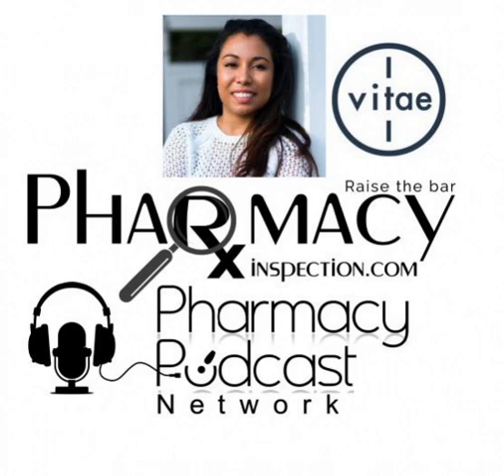But then once we are confident with our internal testing data, we then do send out samples to external testing labs. And external testing labs for, let's say, water-based formulations have done for us beyond use date extending studies, whether that be potency over time or the more rigorous studies that we've had them perform, such as stability indicating assays.